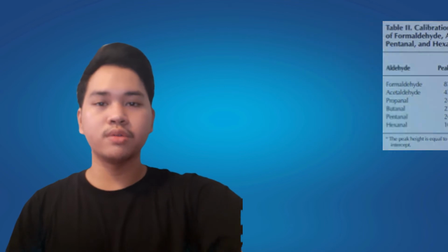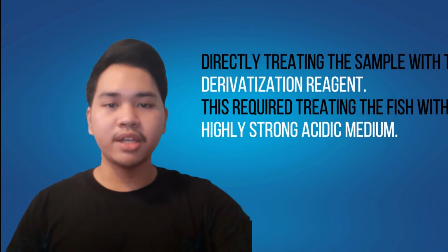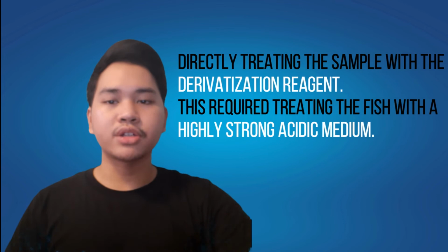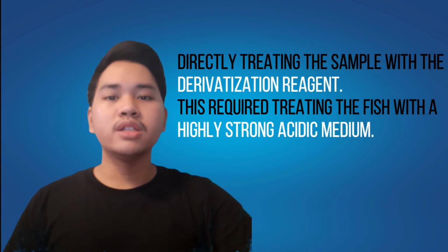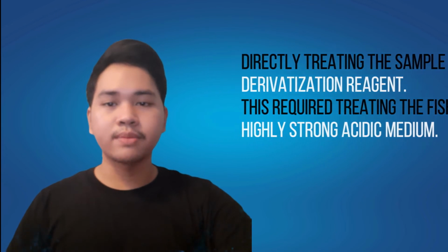Previous methods were based on directly treating the sample with the derivatization reagent. This required treating the fish with a highly strong acidic medium, causing undesirable reactions in the sample. This method only allows for the quantitation of the most electrophilic aldehydes. However, because the pH rose to 5.0 after 20 minutes of direct reaction and the calculated amounts of formaldehyde and acetaldehyde fell, the findings obtained may be only marginally reliable.